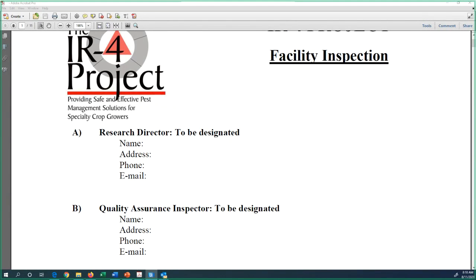First of all, it depends on the method. If you use a reference method, and it specifically says this is the solvent standard, then you have to use the solvent standard. You cannot change that.